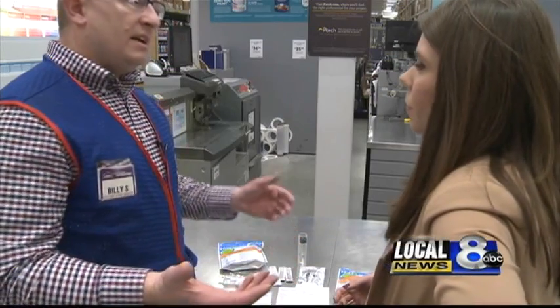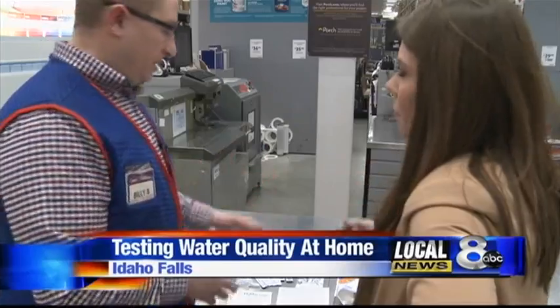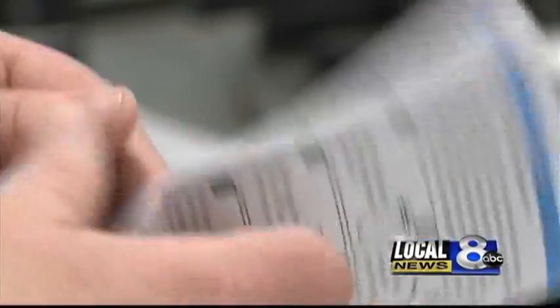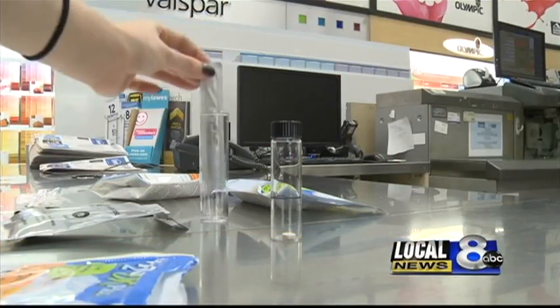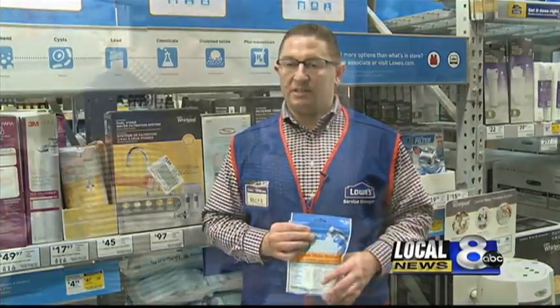If you are interested in knowing if your water is safe or not and you're not really sure, there's a testing kit for that. And you don't have to be a chemist to use it — it's actually very simple. Instructions basically walk you through putting the water into the beaker and putting the proper tablets or testing strips inside to tell you exactly what's in the water.